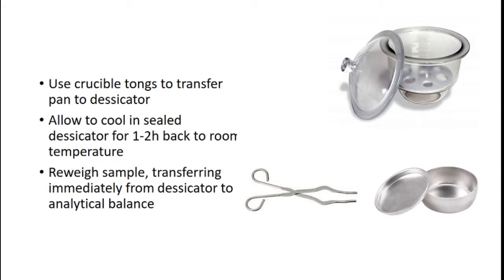And if we're measuring using an analytical balance that's measuring down to milligram quantities, fingerprints or sweat can add enough weight to throw off the validity of your sample. So we're using tongs or tweezers of some sort, so we're not physically touching the cup after it's been dried.